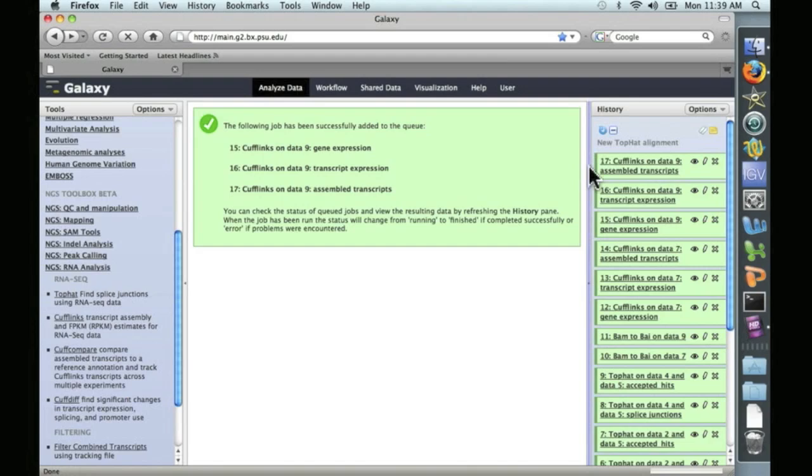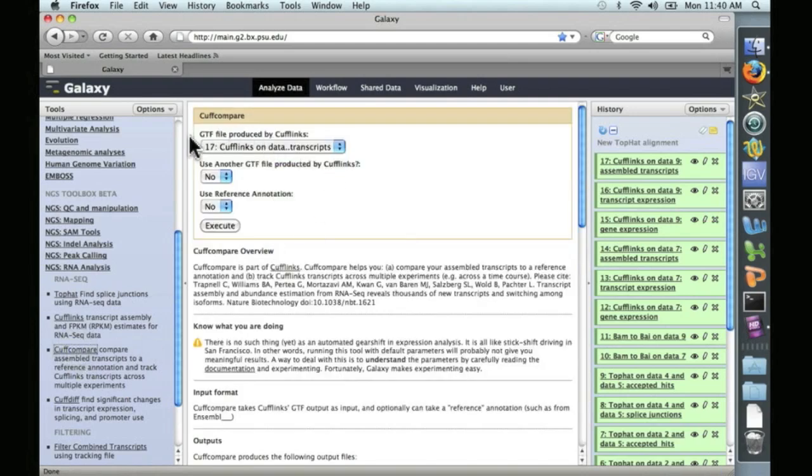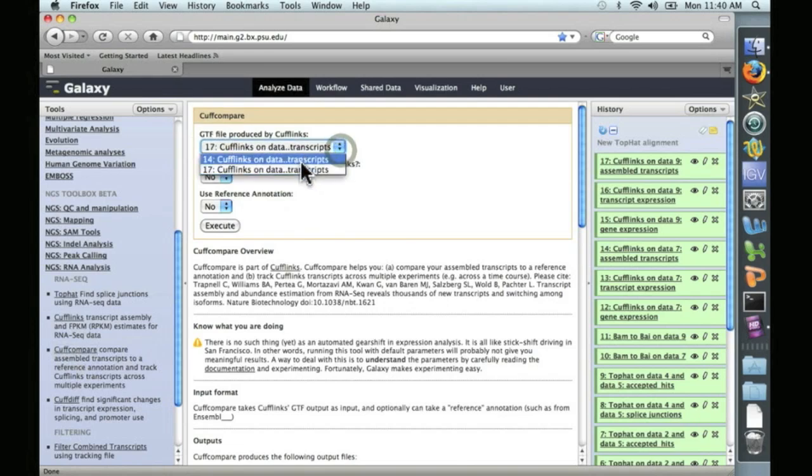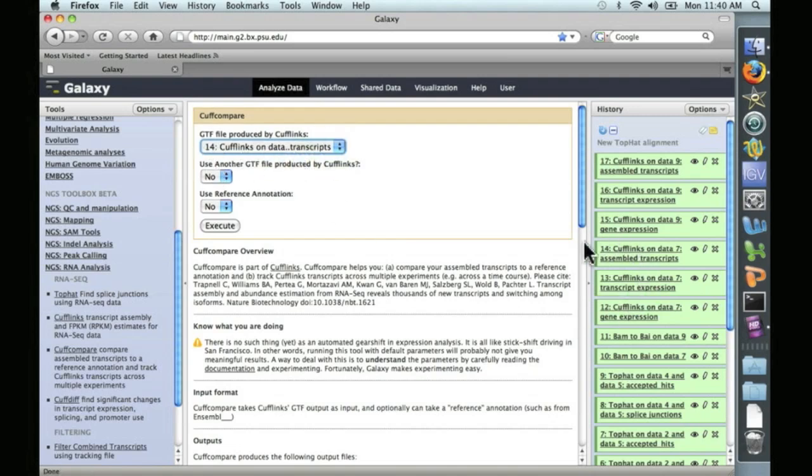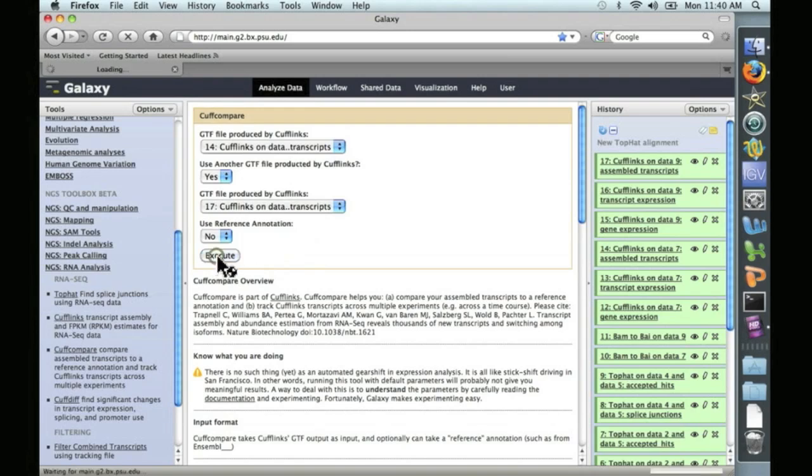The next step is to compare these two to each other. Cufflinks produced a transcript assembly and transcript abundance information. Now we want to compare these two datasets to each other. To do that, we're going to use CuffCompare, which is over here on the left under RNA analysis. We click on CuffCompare. And it asks for a GTF file produced by Cufflinks, which we have. Let's go ahead and just keep them in the right order. This is the first one, the first assembled transcripts. And then, for use another GTF file, we want to say yes, because we want to compare two. And it automatically found the other one. So now we're going to compare these two Cufflinks outputs. So we'll go ahead and run CuffCompare.